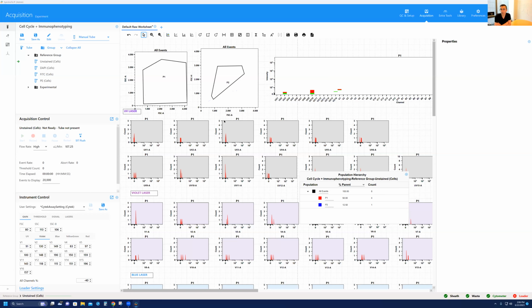Right. Okay. Kathy, I would add, and actually somebody was asking also before, why are you getting also the granulocytes, or actually the monocytes, and are they important in this case? I mean, we actually only have lymphocyte markers, but the whole thing is we have to also distinguish between acquisition and analysis, right? Data analysis. Yeah.